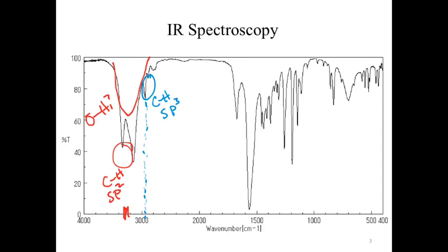As we shift further along, I see this nice big broad peak, and my first assumption from that is carbonyl, carbon-oxygen double bond. Then again, look at that chemical shift. We're looking at 1590. If anything, that smacks of a carbon-carbon double bond, but carbon-carbon double bonds don't give us that nice, characteristic, strong, intense peak. So it's again a bit odd, but that's what it is. Other than that, I don't see anything particularly exciting.